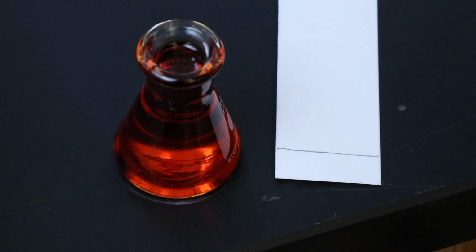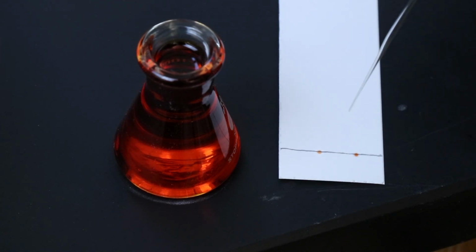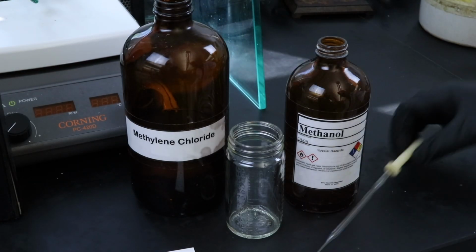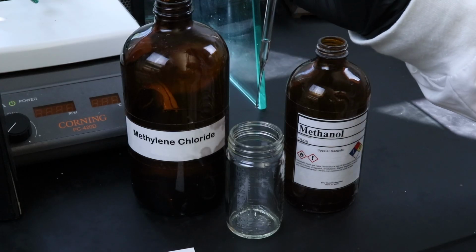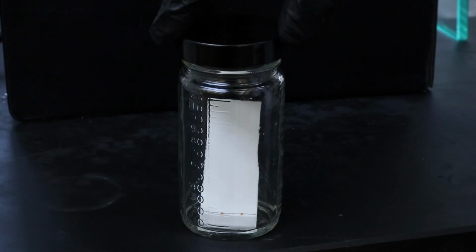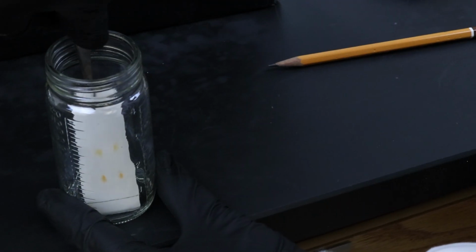To make sure that both products were actually produced, I'll spot a TLC plate, and then I'll use methylene chloride as a solvent to run it with 5 drops of methanol. And here you can already see that there are 2 compounds on each of the spots I made on the TLC plate, so that's a good sign that both products were formed and we can expect to have a separation during the column.